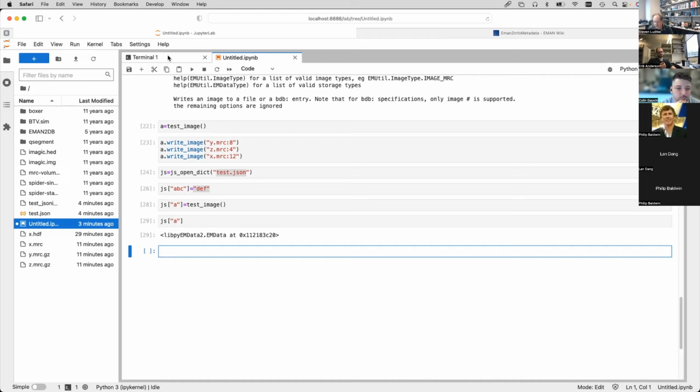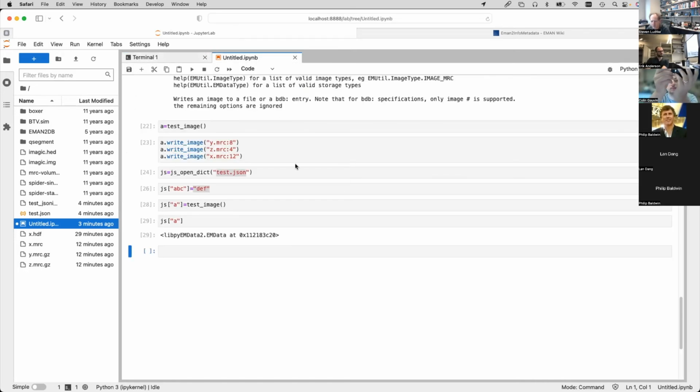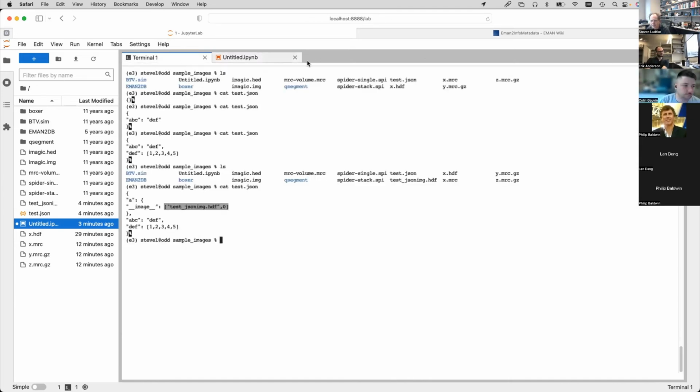Finally, when HDF started supporting things, we made a transition sometime around 2012, 2013, around the time RELION came out. We finally kind of fixed that aspect of EMAN2 and started using HDF files and using JSON files for the metadata. So we started making another transition of sorts now as we're kind of moving towards EMAN3. We've always had, and this dates back to EMAN1, these LST files floating around. So if we look, let me go back to, yeah, we'll just do it here.